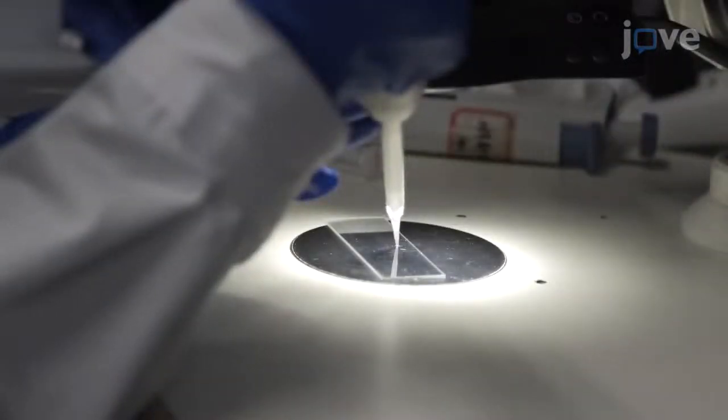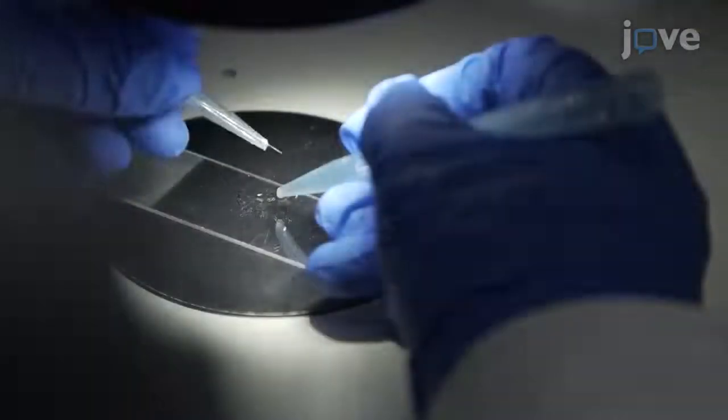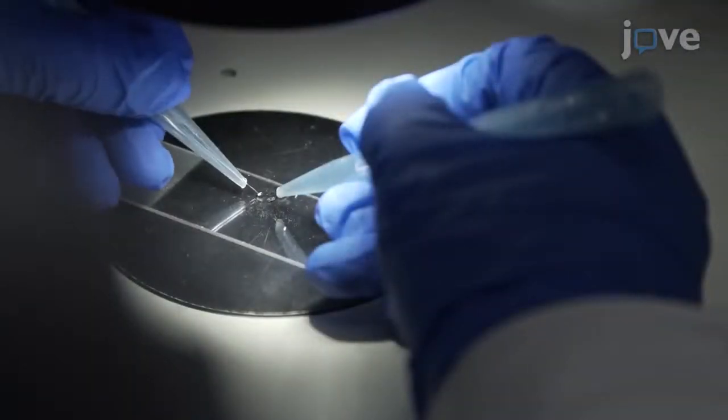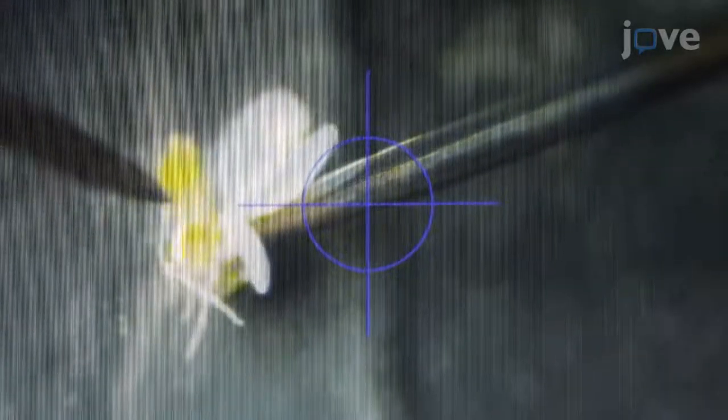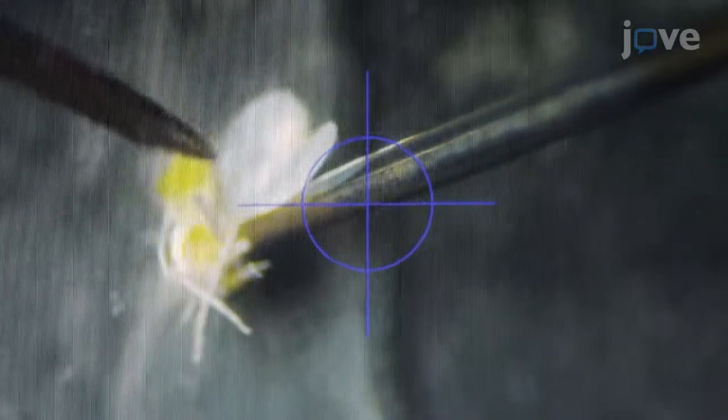To collect a hemolymph sample, add 10 microliters of PBS onto a new microscope slide and place a new whitefly into the droplet. Use a fine acupuncture needle to gently make a hole in the abdomen. Then apply slight pressure to the abdomen to release the hemolymph into the buffer and collect an 8 microliter sample of the liquid.